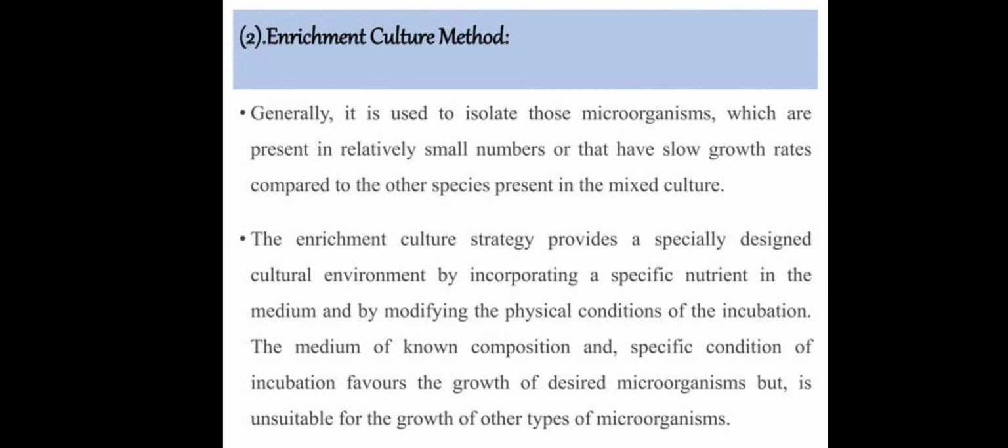Enrichment culture method. Generally, it is used to isolate those microorganisms which are present in a relatively small number or that have slow growth rates compared to the other species present in the mixed culture. The enrichment culture technique provides a specially designed cultural environment by incorporating specific nutrients in the media and modifying the physical conditions of the incubation.